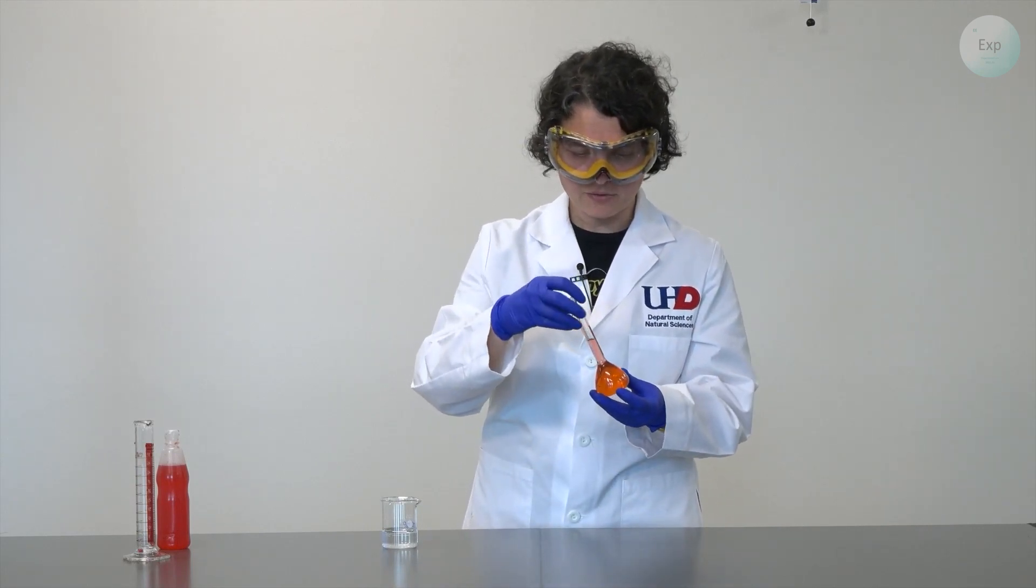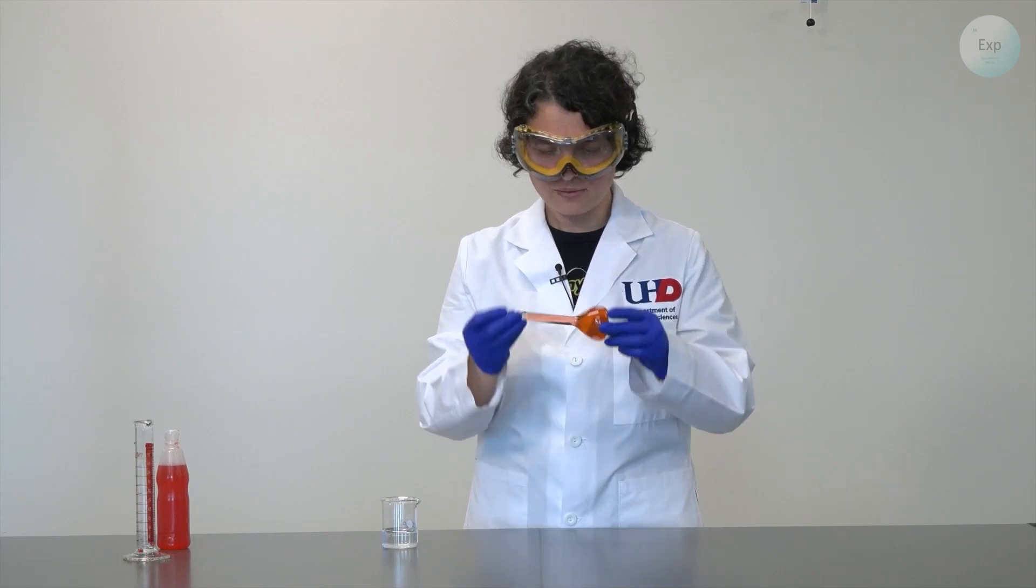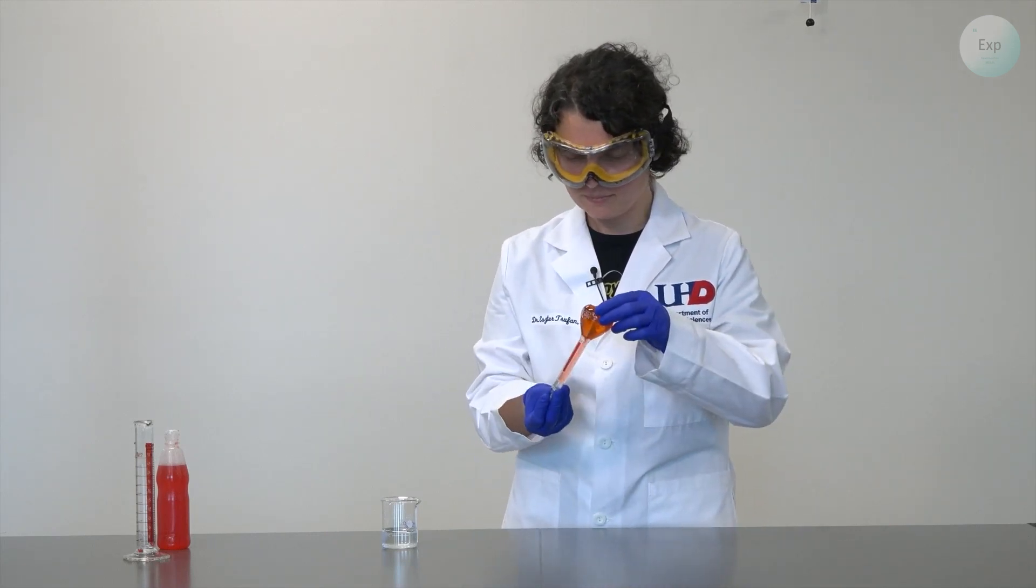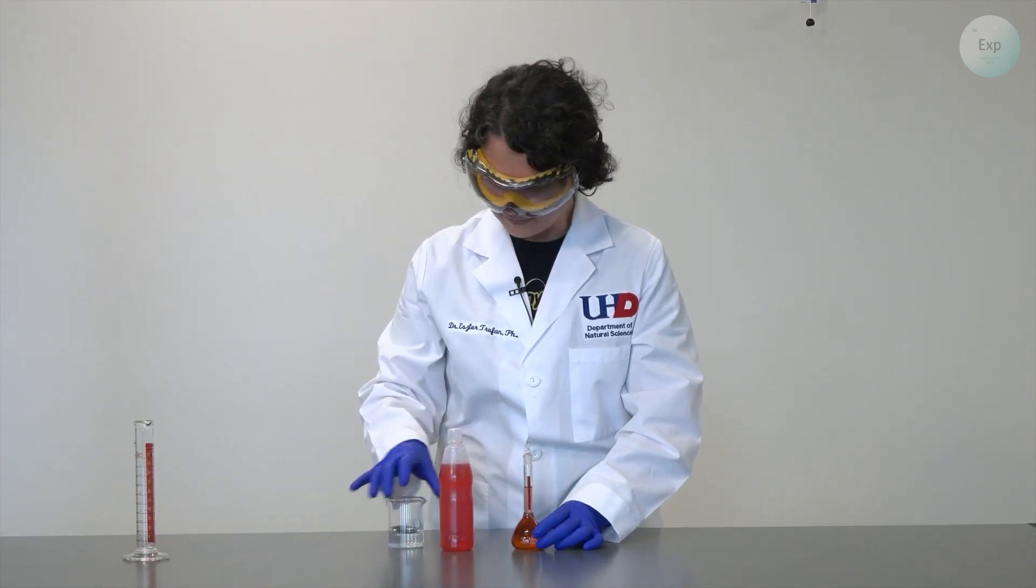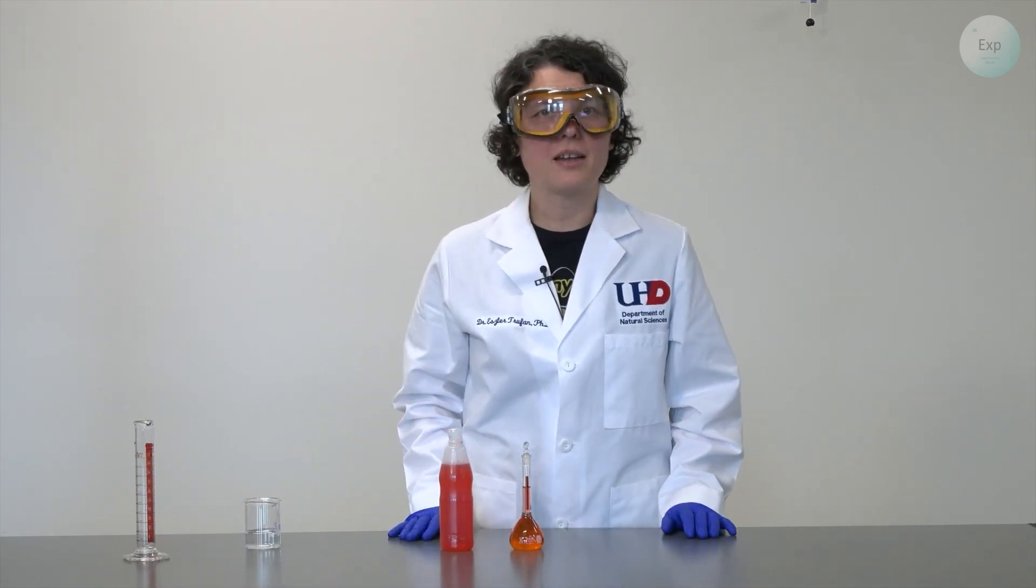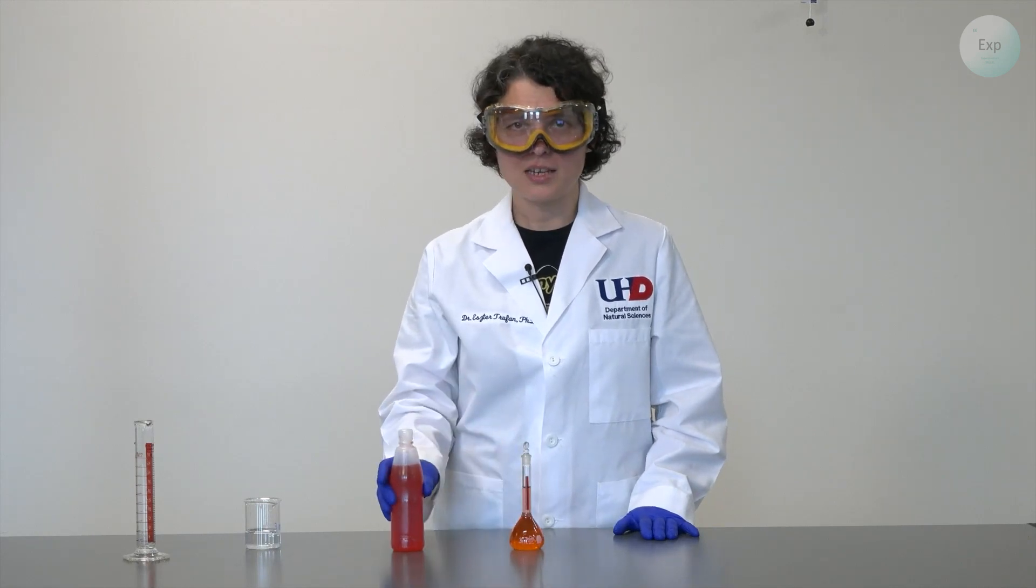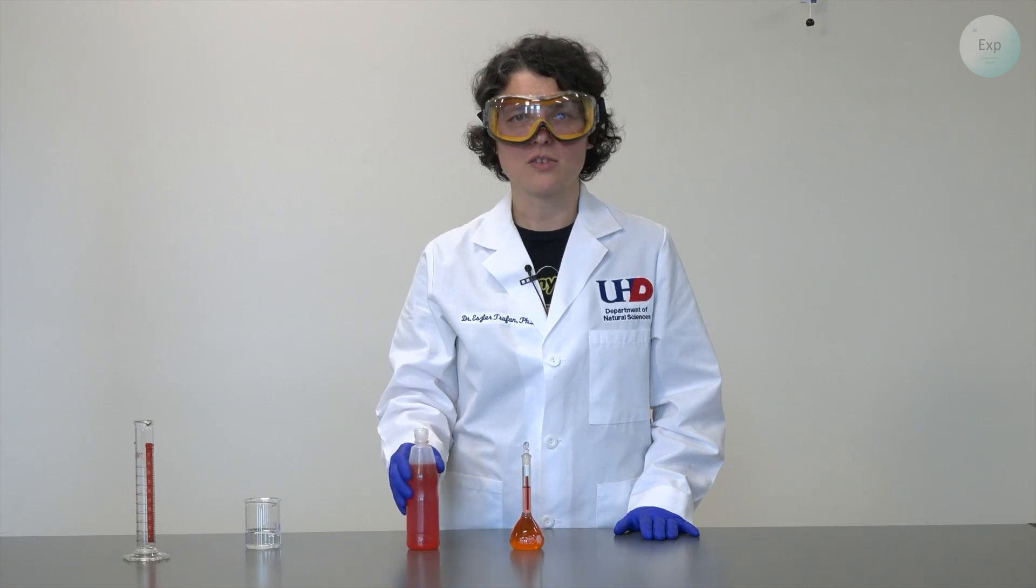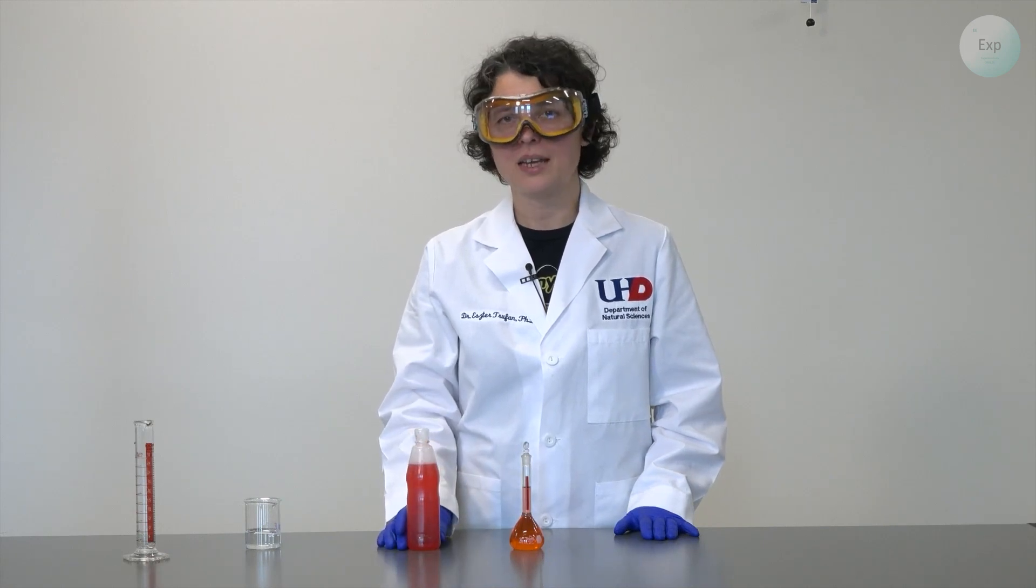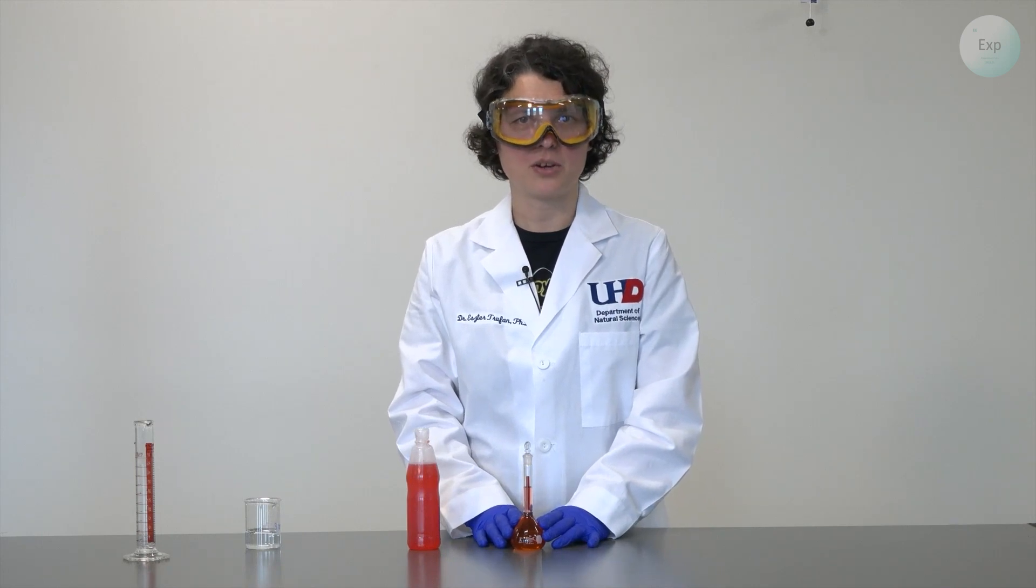We know the original amount of solute that we added even though it was from a juice concentrate. There are a couple ways in which we can find the exact concentration of the solution that we just made. One of which is to search for the concentration of the juice concentrate and simply do a dilution calculation. That will get us approximately in the right neighborhood.